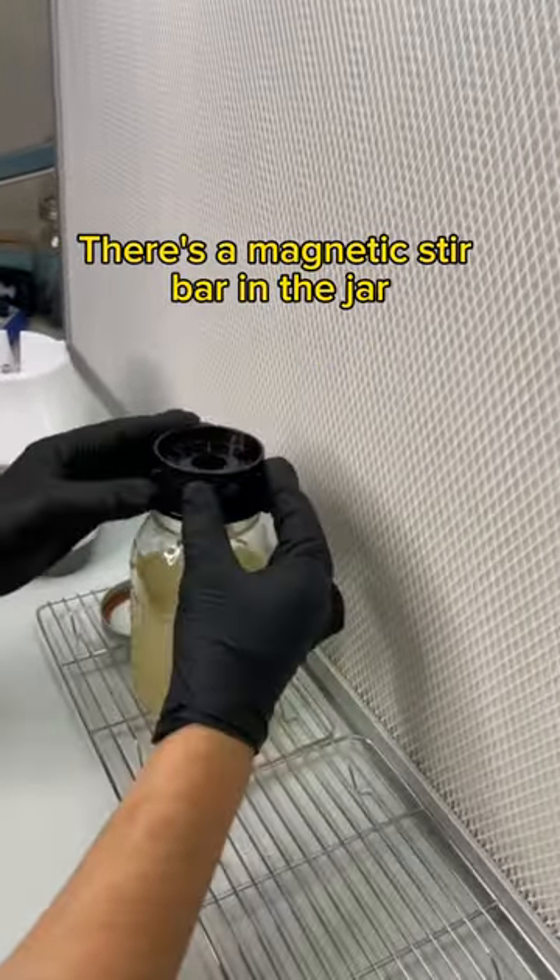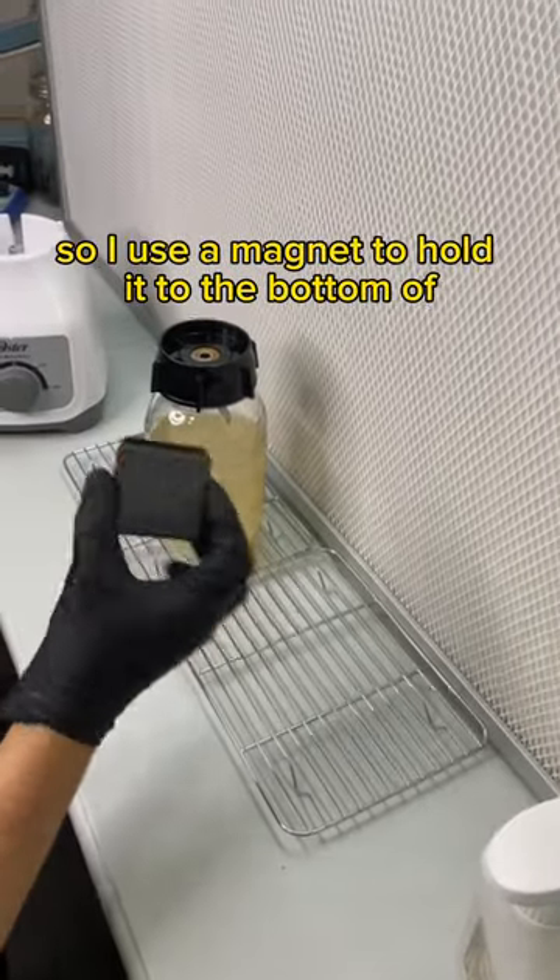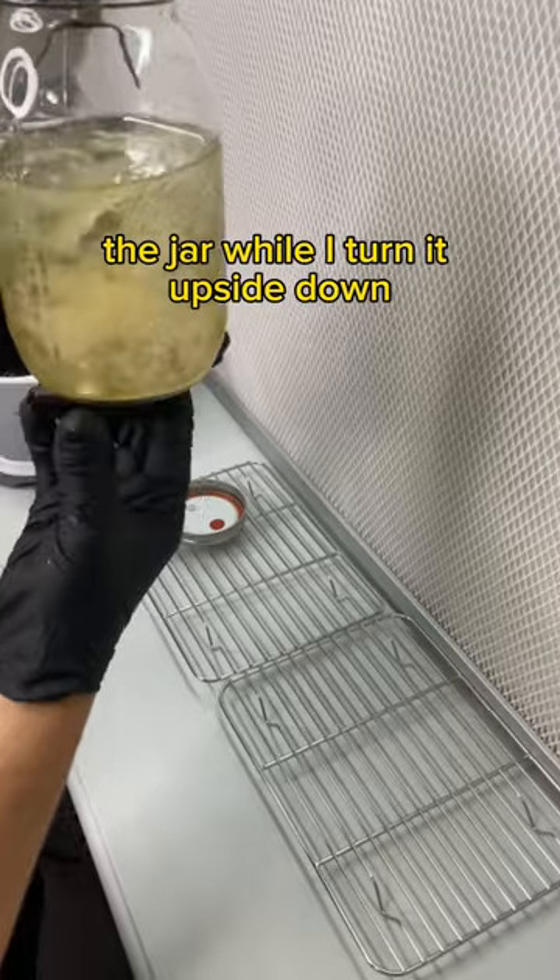There's a magnetic stir bar in the jar that I don't want to get chopped up by the blade, so I use a magnet to hold it to the bottom of the jar while I turn it upside down.